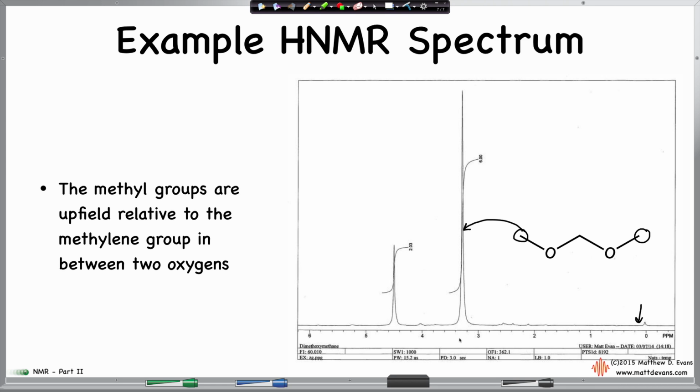They are actually more like, we already said this before, 3.3 ppm, and that's due to the effects of the oxygens, which are pulling electron density towards them, and that tends to deshield the hydrogens, and that's why the peaks are here. Now this central CH2, this methylene group, experiences this even more because we've got two oxygens each pulling electrons away from these hydrogens, so in that direction and this direction, and that's why this value is about 4.5. Because the effect is even stronger. These two hydrogens are sandwiched between two oxygens, so really deshielded compared to the other ones.